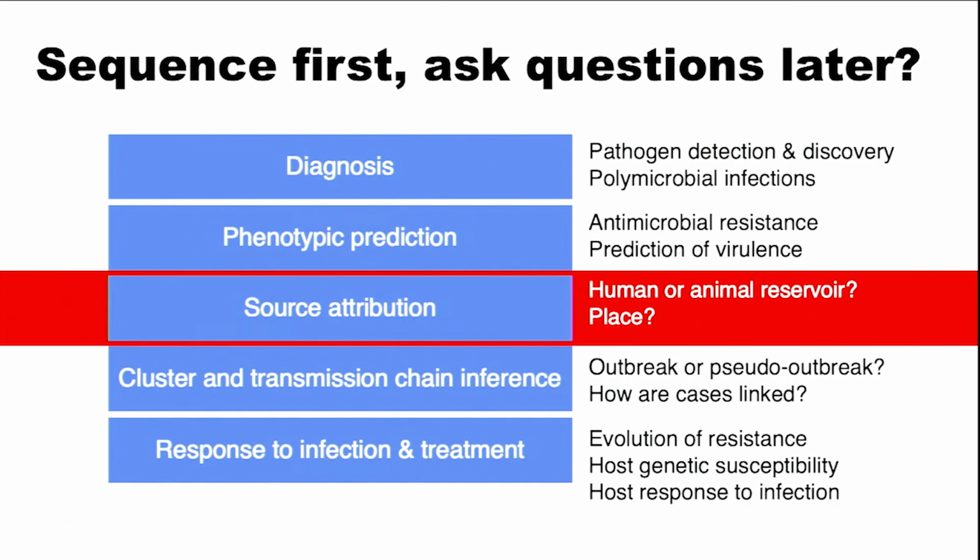Phenotypic prediction from genomes is difficult, and will continue to be difficult, but for important clinical phenotypes like antibiotic resistance, for some organisms like TB and Staph aureus, we're actually quite good. We're actually as good as in vitro methods at determining phenotypes just from genome data. And if we add in things like gene expression data, we can get even better. So that's an important use of getting genomes. And obviously, in the example of TB, we can sequence a TB genome much more quickly than we can isolate it and do antibiotic phenotypic testing on plates.